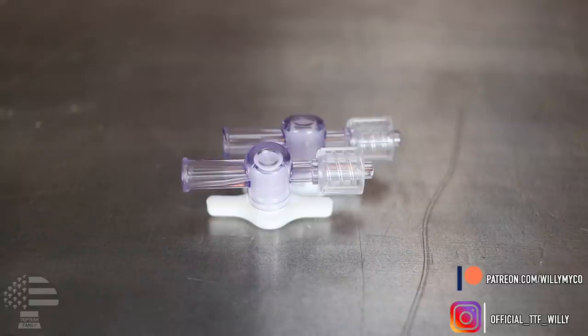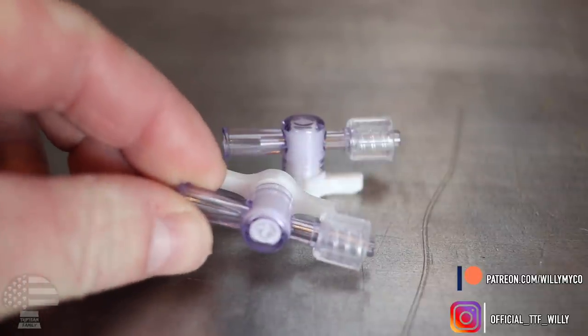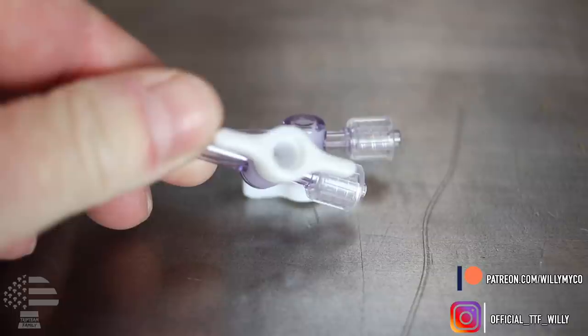The next thing you need is your stopcocks — these are luer lock male one-way stopcocks. I know that sounds like a funny name but that's their actual name. Once you have your luer lock male one-way stopcocks you're pretty much all set. As always, we're going to be working inside a still air box — or if you have a flow hood, use that. Make sure you're using gloves, hand sanitizer, flame sterilizing, disinfecting your surfaces, and that your flow hood is operating at the correct capacity.